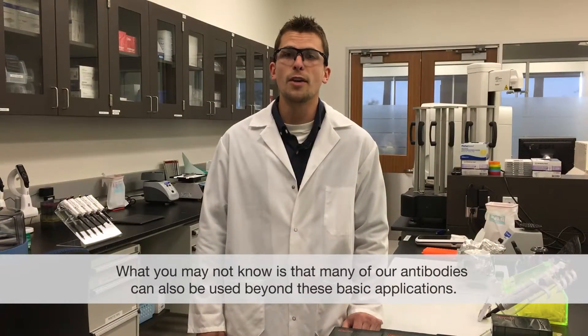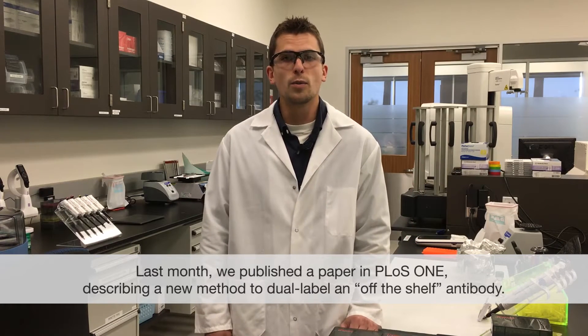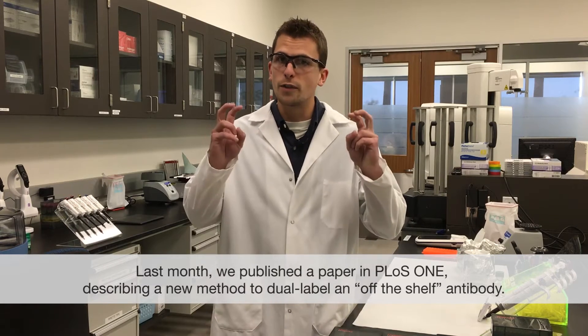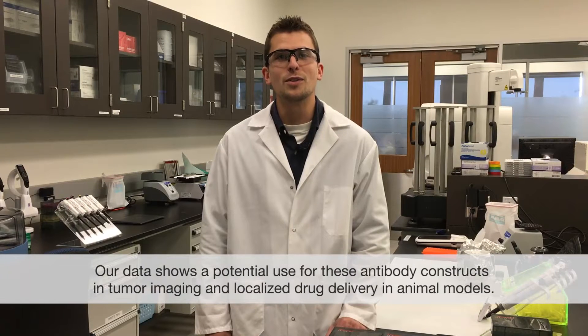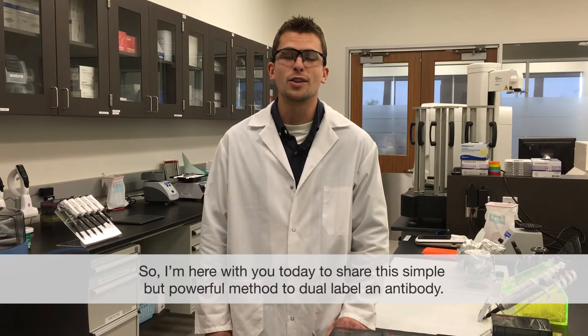What you may not know is that many of our antibodies can also be used beyond these basic applications. Last month we published a paper in PLOS ONE describing a new method to dual label an off-the-shelf antibody. In our system we combine an antibody against a cancer biomarker with both a fluorescent dye and a chemotherapeutic drug to synthesize a fluorescent antibody drug conjugate. Our data shows a potential use for these antibody constructs in tumor imaging and localized drug delivery in animal models.